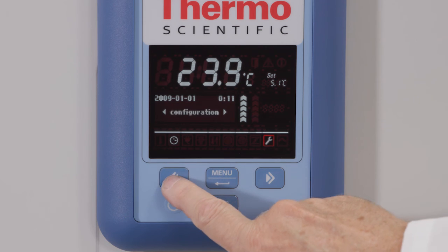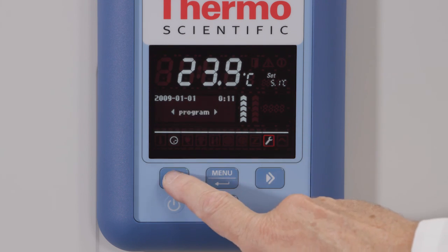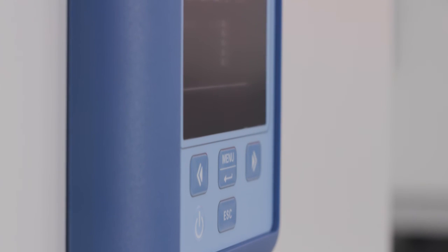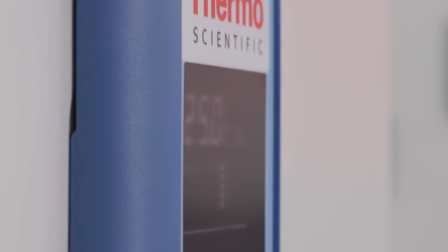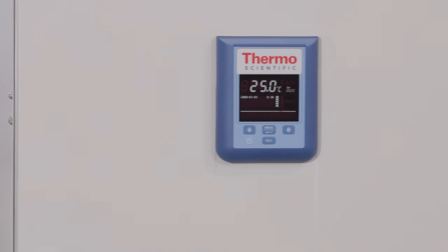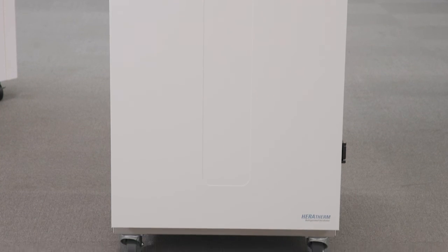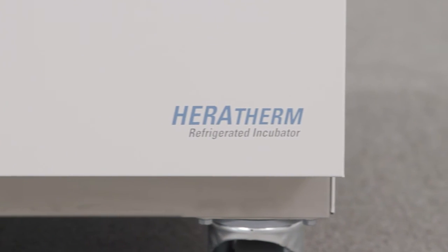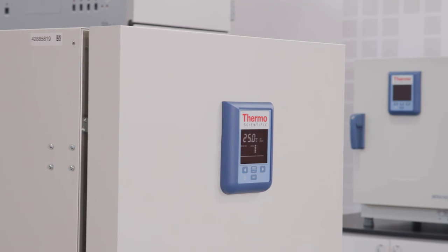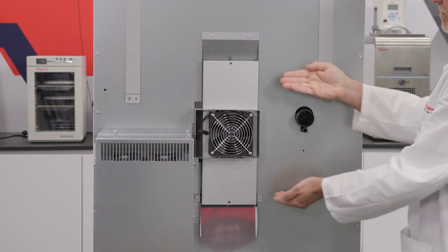The manual also contains instructions to change the temperature display units, adjust settings like the over-temperature alarm, and adjust the fan speed. The Thermo Scientific Heratherm refrigerated incubator represents a refinement in incubation, complete with microprocessor control, push-button calibration, and a large clear vacuum fluorescent display. Eliminating the need for refrigerants and other hazardous substances, Heratherm refrigerated incubators use Peltier modules to cool and heat thermoelectrically, making it a greener alternative.